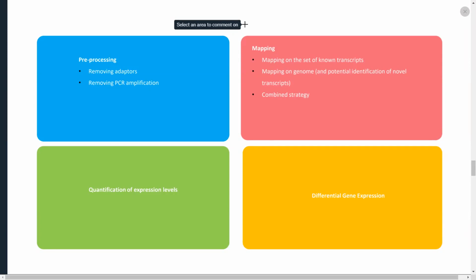What it does is it produces a table which shows how much expressed is your particular RNA in a particular sample. We can build a pipeline till this, where you get your expression table and do further analysis like PCA and factor regression analysis, or we can go one step further and perform a differential expression analysis using DESeq2 or edgeR algorithm. So what a differential expression pipeline tells us, we will be covering today, and I would like to show you what differential expression actually means.